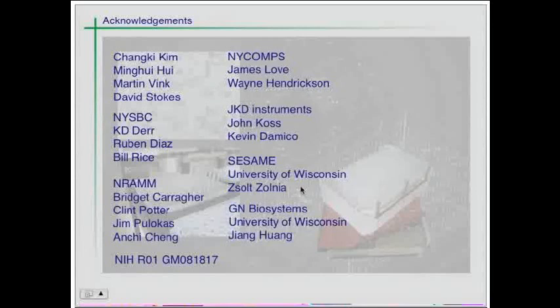So to assemble the dialysis block, you can either do it manually with a multi-channel pipette, and then it takes about 10 minutes to load, or you can use a liquid handling robot. But we do it manually with a multi-channel pipette. And afterwards, the blotting is also manual? No, the blotting is done with a liquid handling robot. And that works?